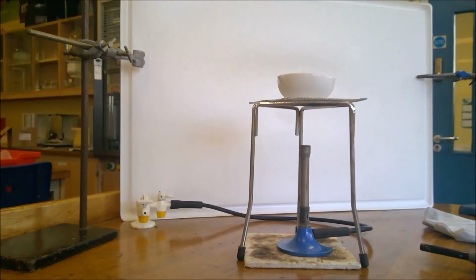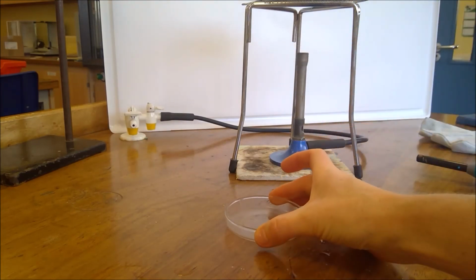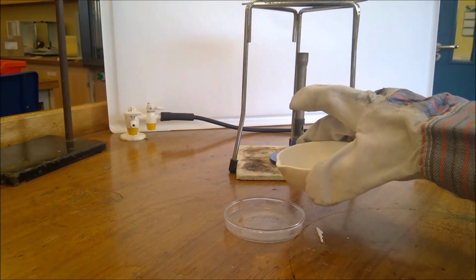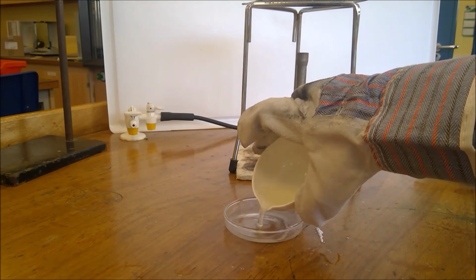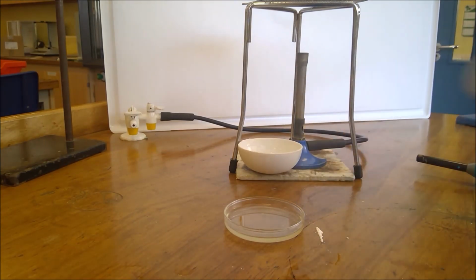And then we're going to put our solution now into our crystallizing dish. Once the crystals are in the crystallizing dish, we're going to leave them to cool and crystallize, and then we can see what they look like. So this is still very hot, so I'll have my gloves on here. I'm going to swirl this slightly, so then I can pick up any crystals that were starting to form at the edge, and then I'm pouring that into my crystallizing dish there. So I can go back on the heatproof mat because it is rather hot.